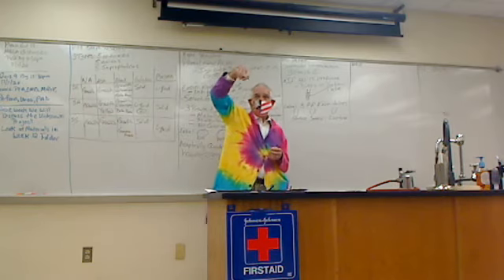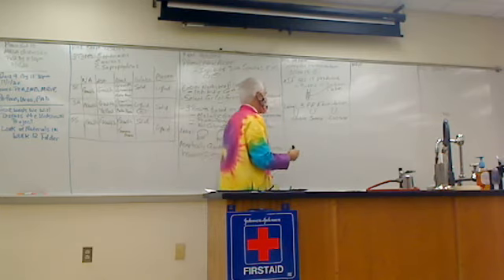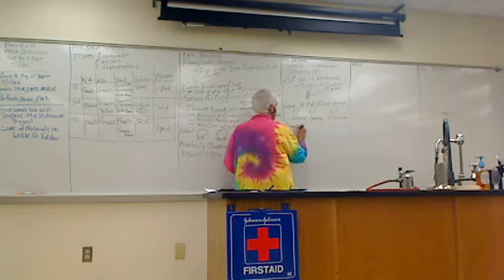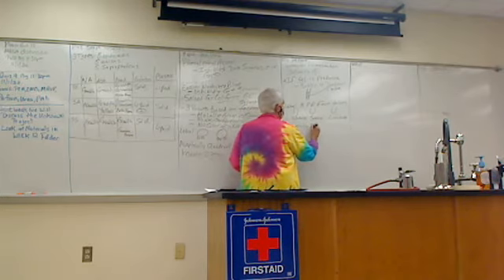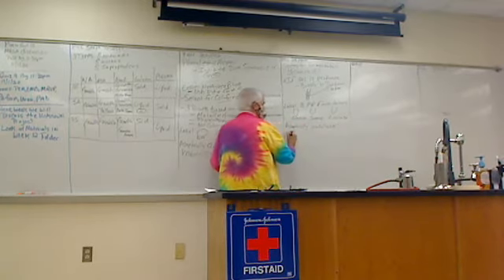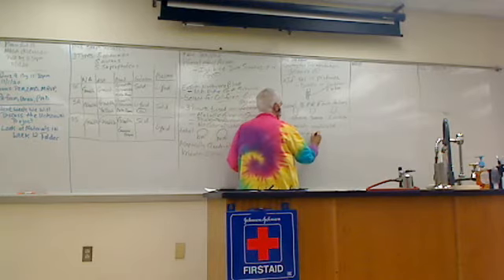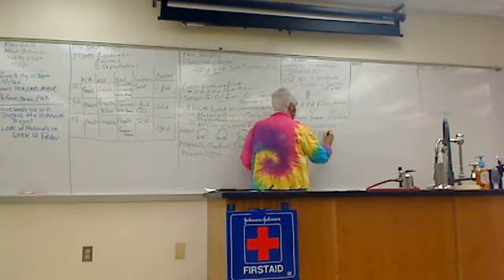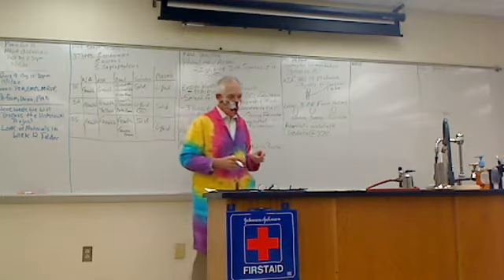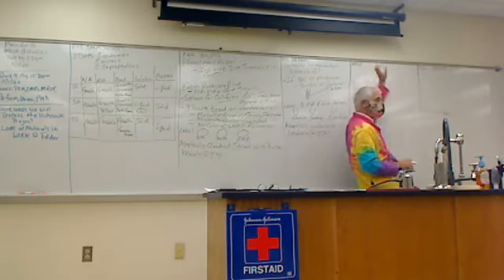Stick it in, shake it off, flame your loop again, go in, etc. For that, so aseptically, inoculate, and then we're going to incubate at 37 degrees.